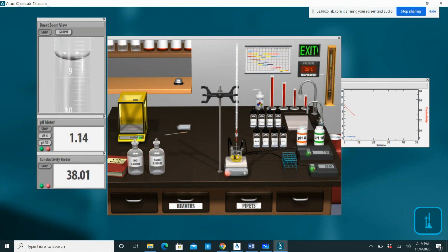Look at that, the pH value is slightly going to go. And again, I do not care about the conductivity, which is the red line. I'm going to focus more on the blue one. What I would do for this titration is, after it reaches about, let's say, 21 ml, I'm going to start having it go dropwise.